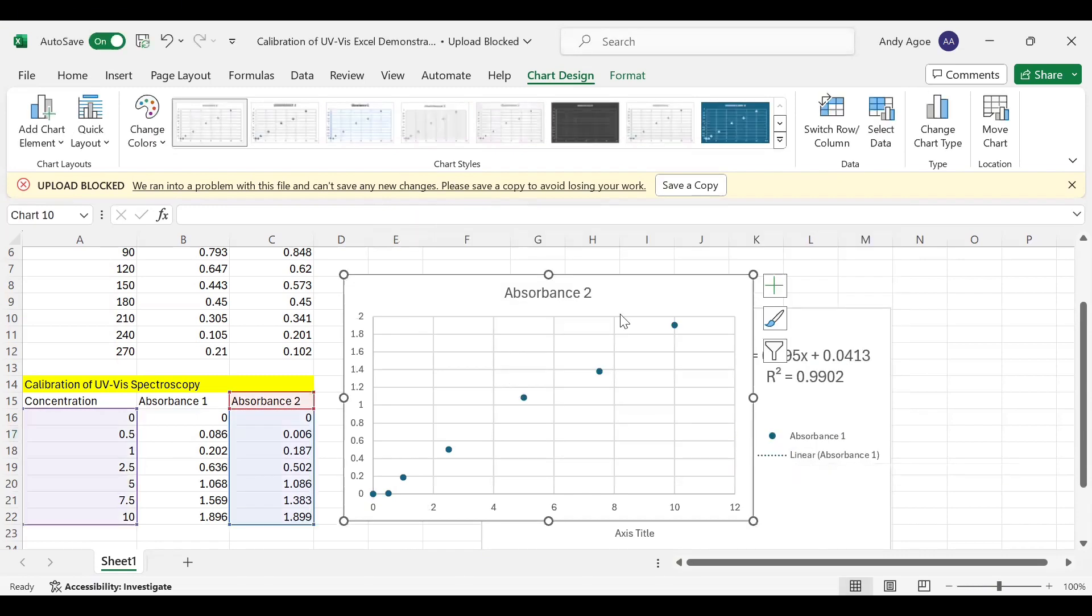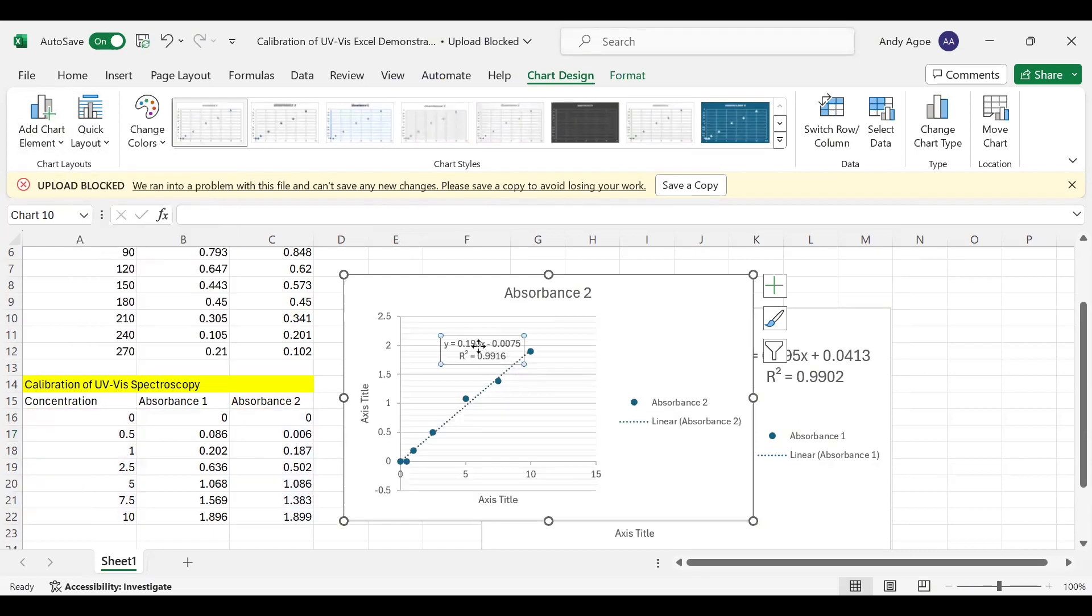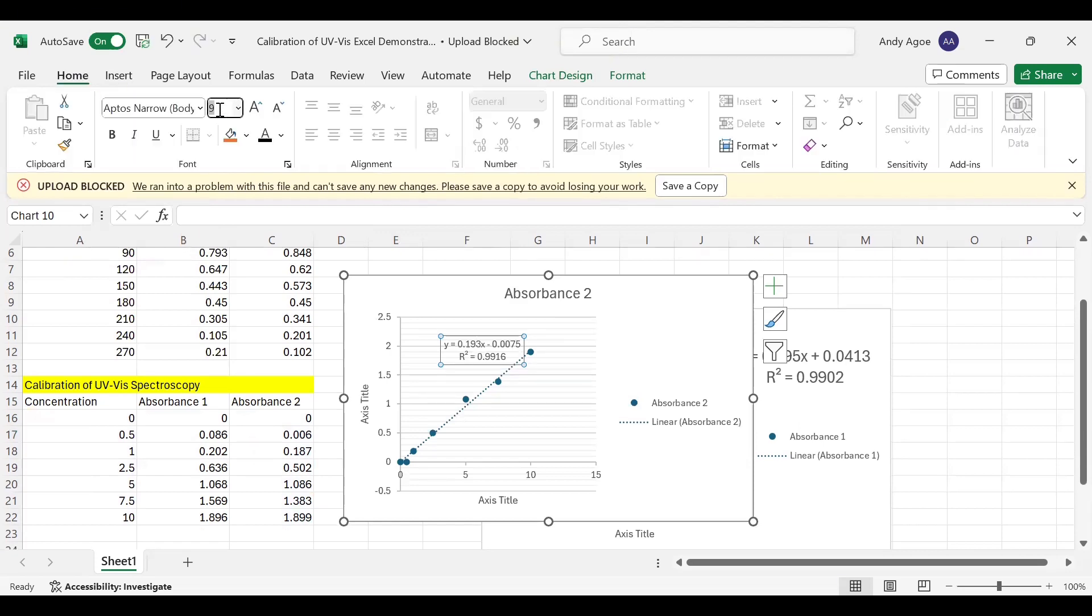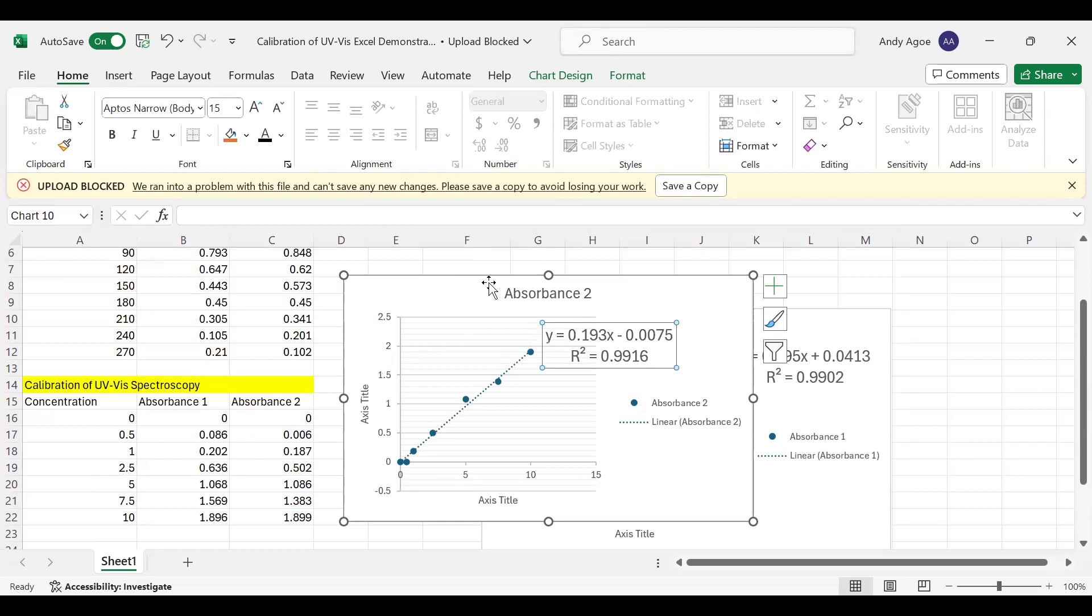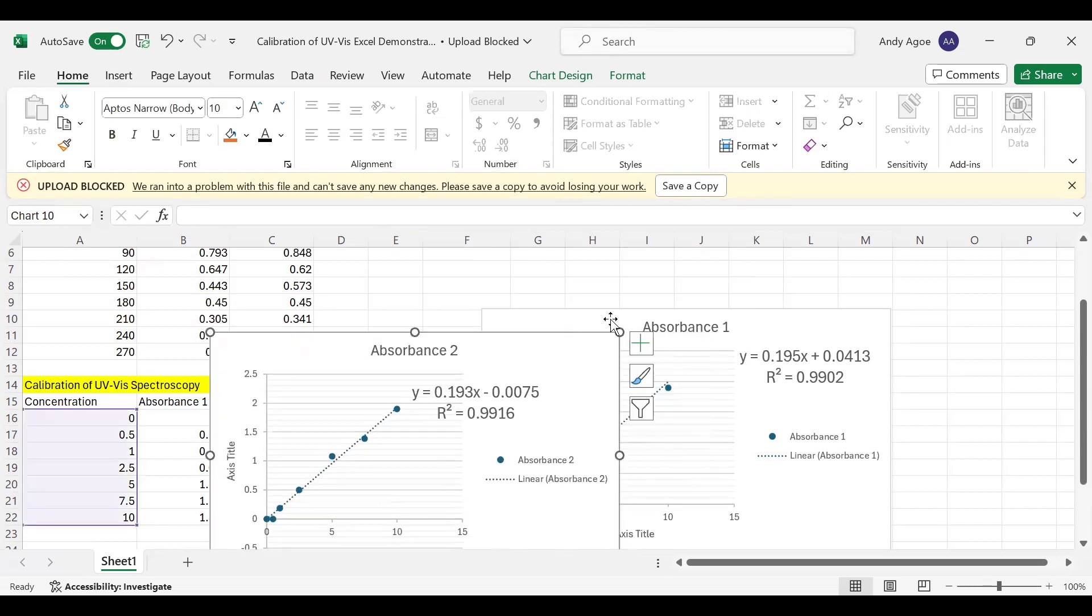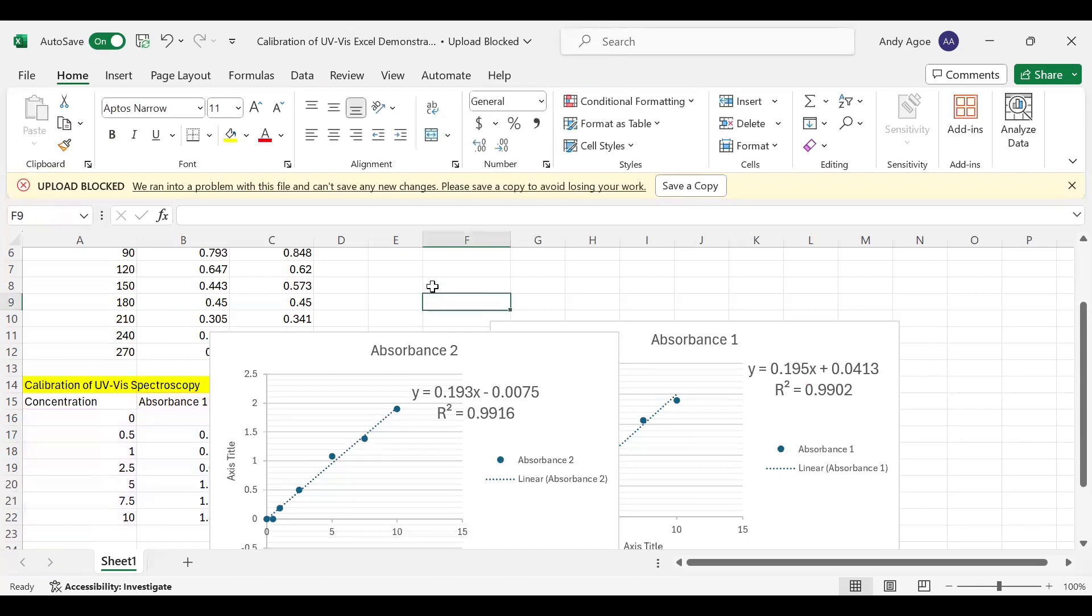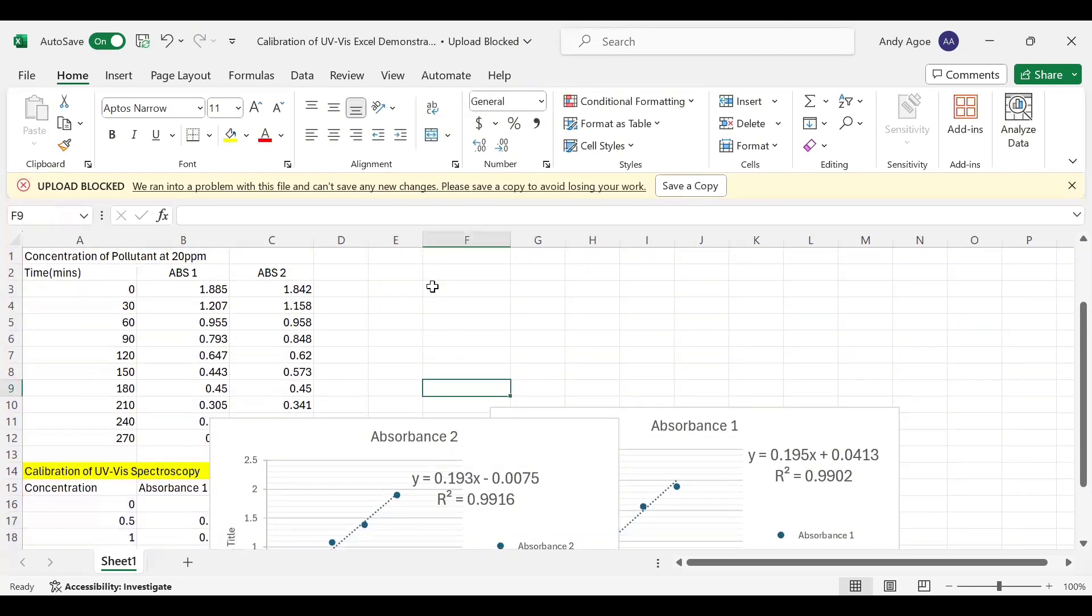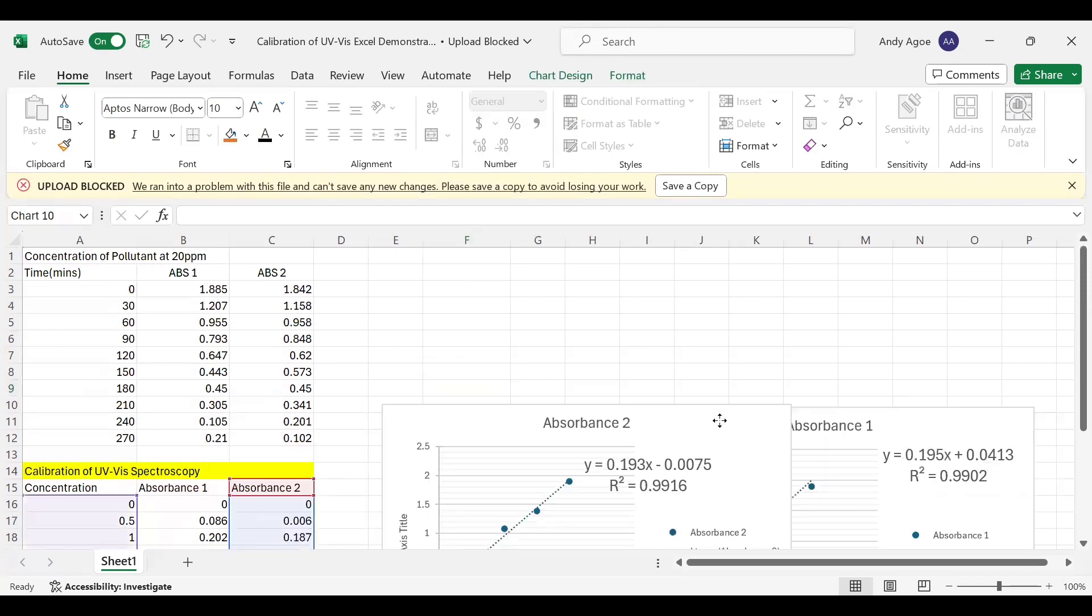Now to display the equation of a line, we go to Quick Layout, and our function is well displayed. Let me increase the font size to 15 as well. So now we have our Absorbance 1 and our Absorbance 2. Let's now try to convert our absorbance into concentration.